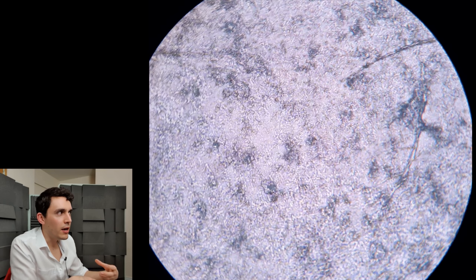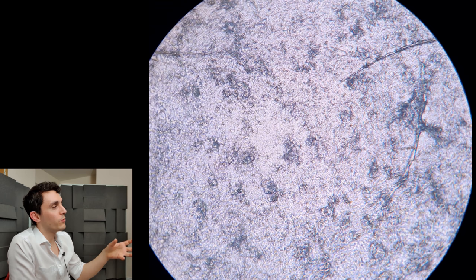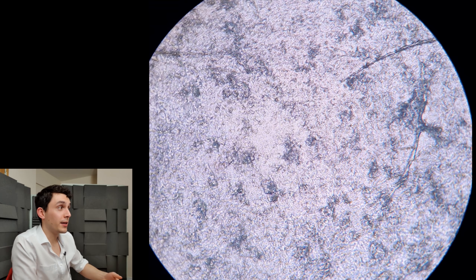So this is the view through the microscope. I'll just pause it here so I can explain what you're looking at. The background of the microscope slide is white, so anything else that's on the white background is stuff on the slide.